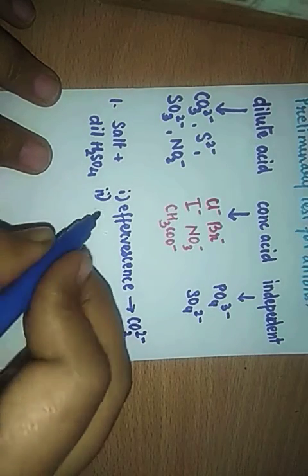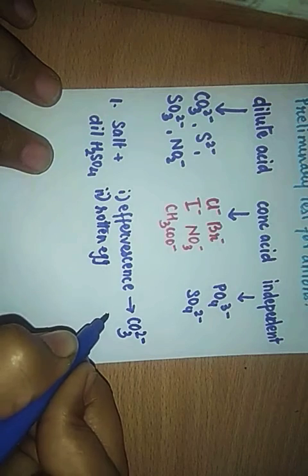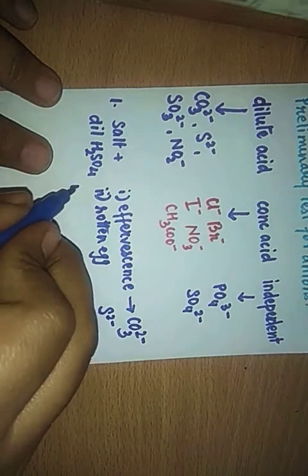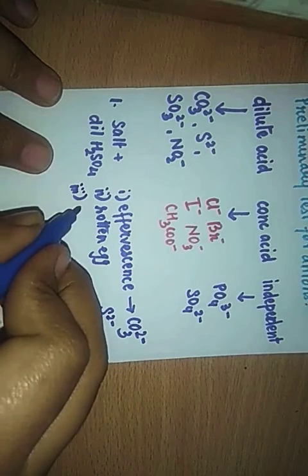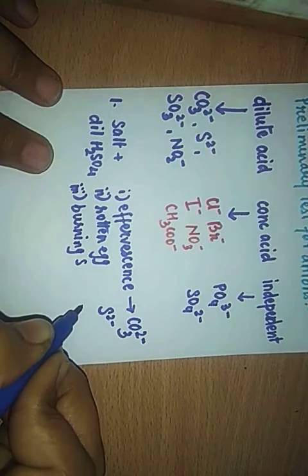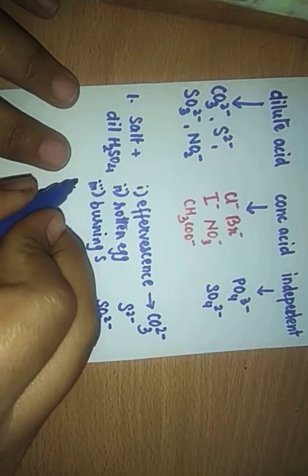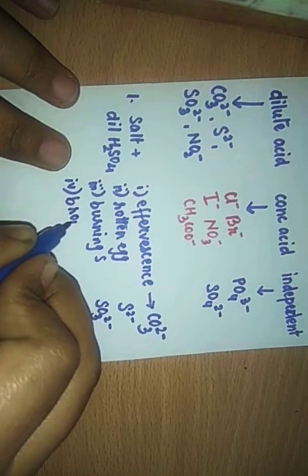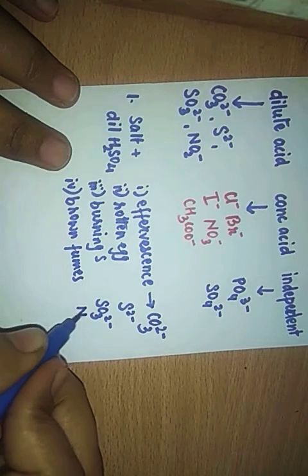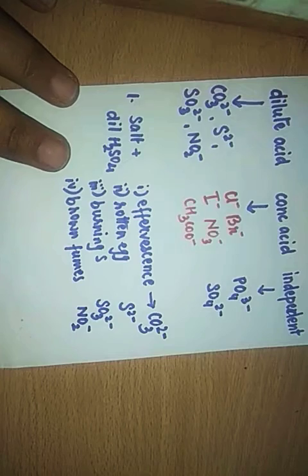Then if it has a rotten egg like smell, it can have sulfide ion because of release of H2S gas. If it has a burning sulfur like smell, it may have sulfite ion. But if it gives brown fumes, then it can have NO2 minus, that is nitrite ion. So this is the dilute acid group.